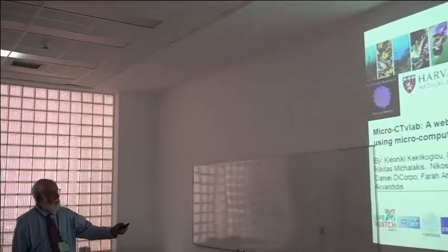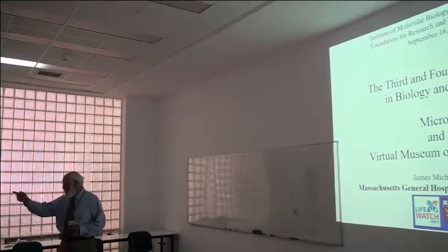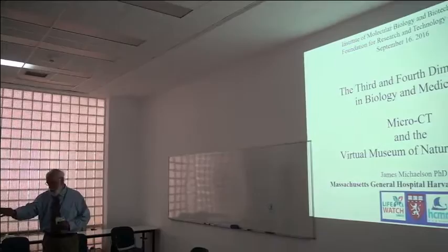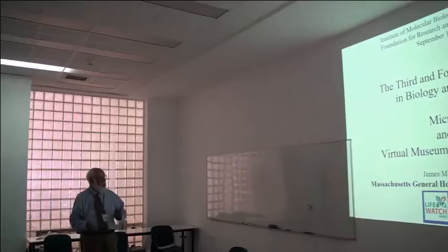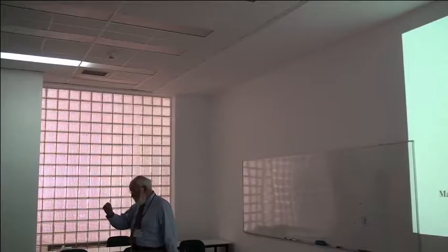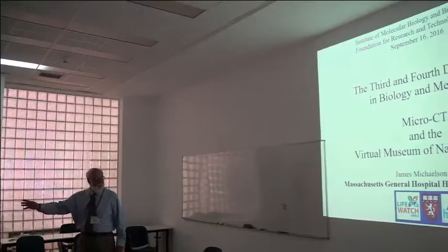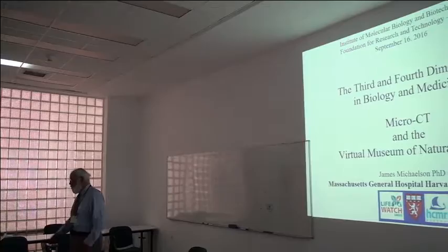It works. So I'm going to talk today about our work, which is a collaborative project. I forgot to acknowledge Christos. Christos and I, between the Mass General, a whole bunch of organizations we'll see in a minute, and Life Watch Greece and the HCMR, on the third and fourth dimension in biology and medicine, which we study with this quite new and interesting technology called micro CT, kind of like a CT, but it's called micro CT because it's a micro focus CT. The X-ray is small, the machine weighs 6,000 pounds. The machine is not micro, although we have a smaller machine. Christos' machine is about 1,000 pounds, and I have a 500-pound machine. And something called the Virtual Museum of Natural History, which is a joint project to share the data.